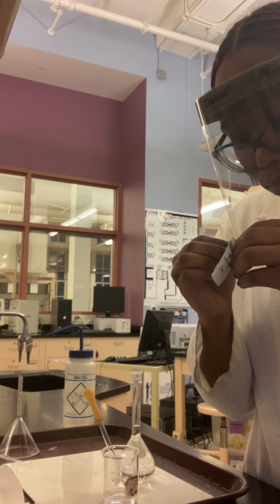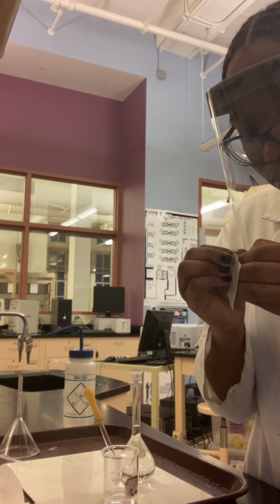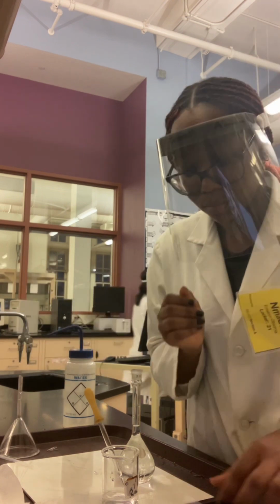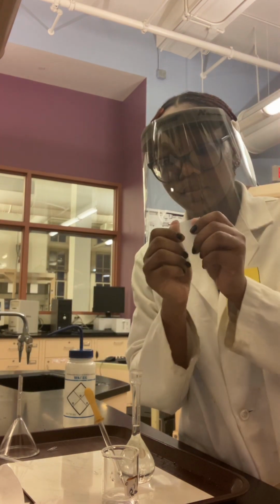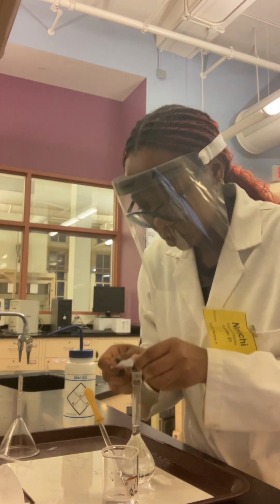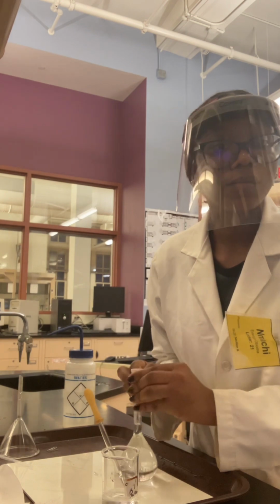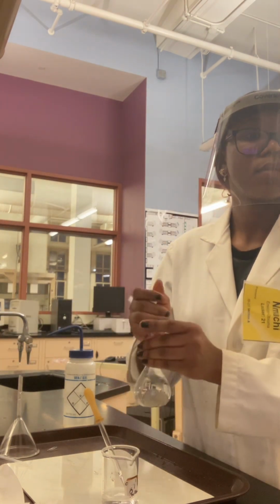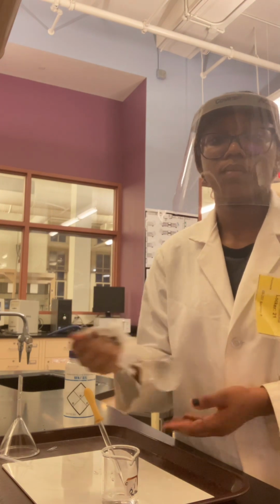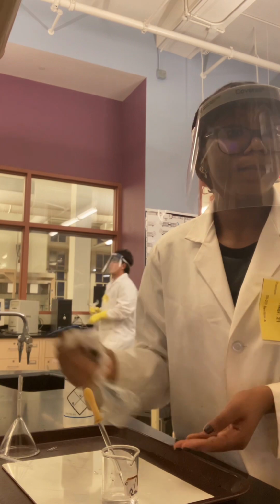And then once again using parafilm to cover and mix the solution. So I secured the parafilm onto the top of the volumetric flask and I mixed thoroughly.